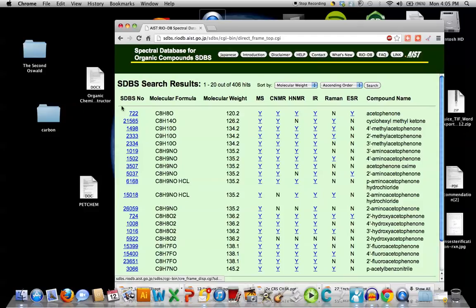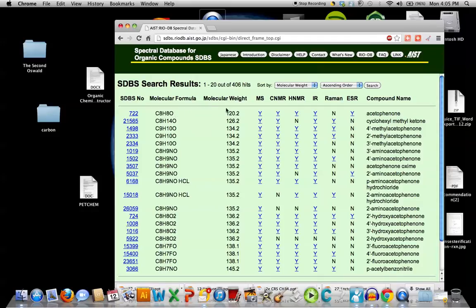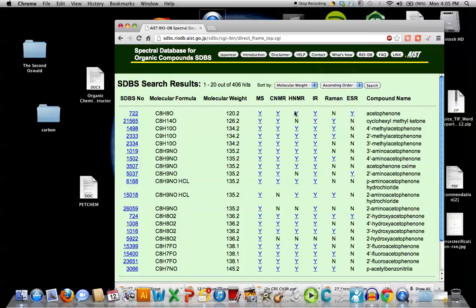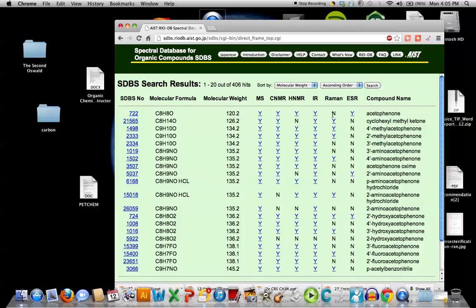Okay, there it is. Catalog number SDBS is 722. The molecular formula is C8H8O. The molecular weight, the molar mass is 120.2 grams per mole. And then they have there the mass spec, the C13, the proton NMR, the infrared. There's no Raman because it has a dipole moment. Inactive compounds don't have infrareds. You would have to get a Raman microwave area. And ESR deals with radicals generated. We won't worry about that in the petroleum course.